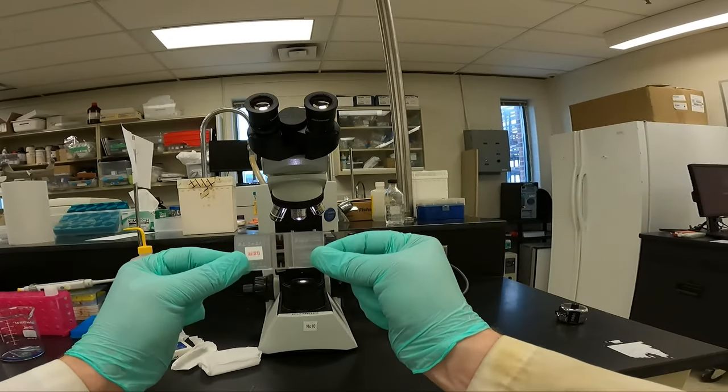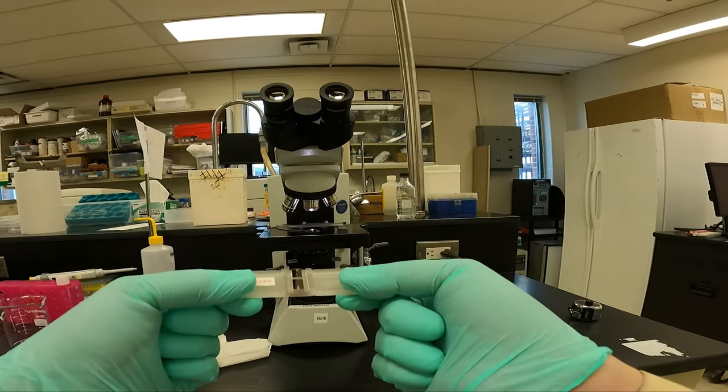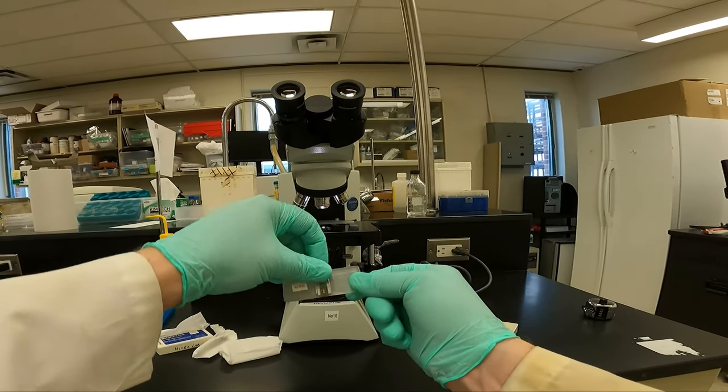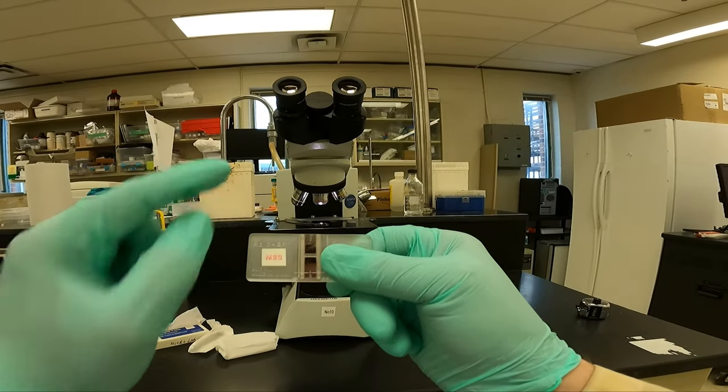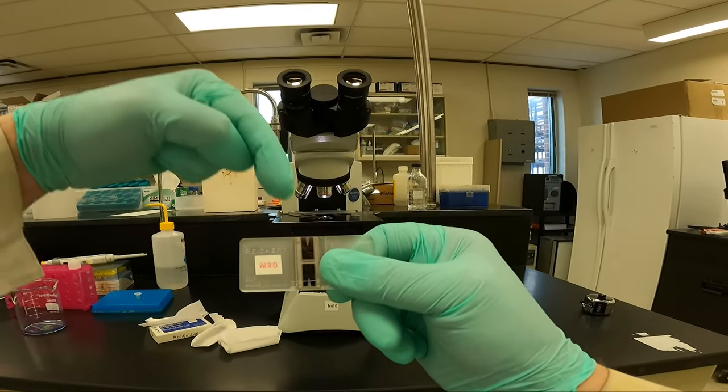And here's a hemocytometer. It is very expensive. There are two sides to it. Put the coverslip on in portrait view and we load it with the two Vs right there. Load there and load there.